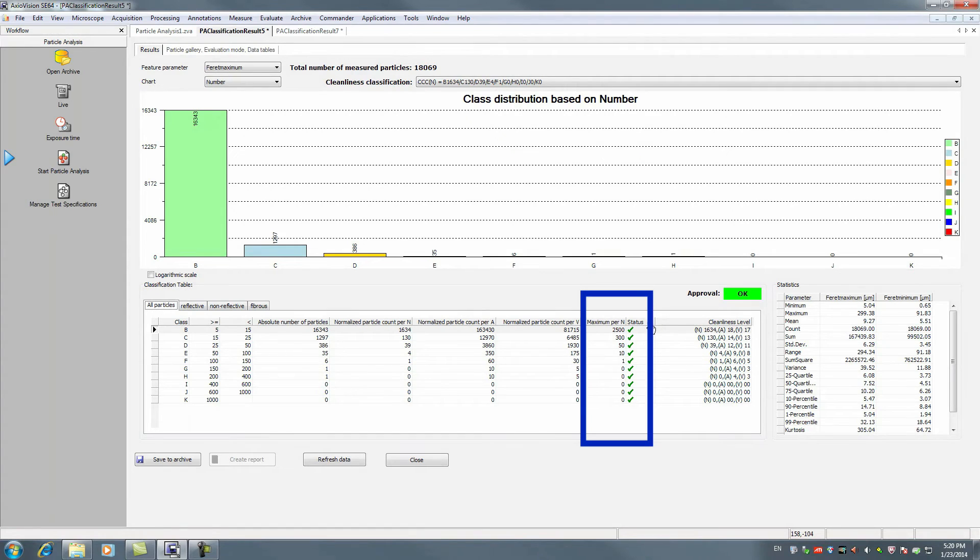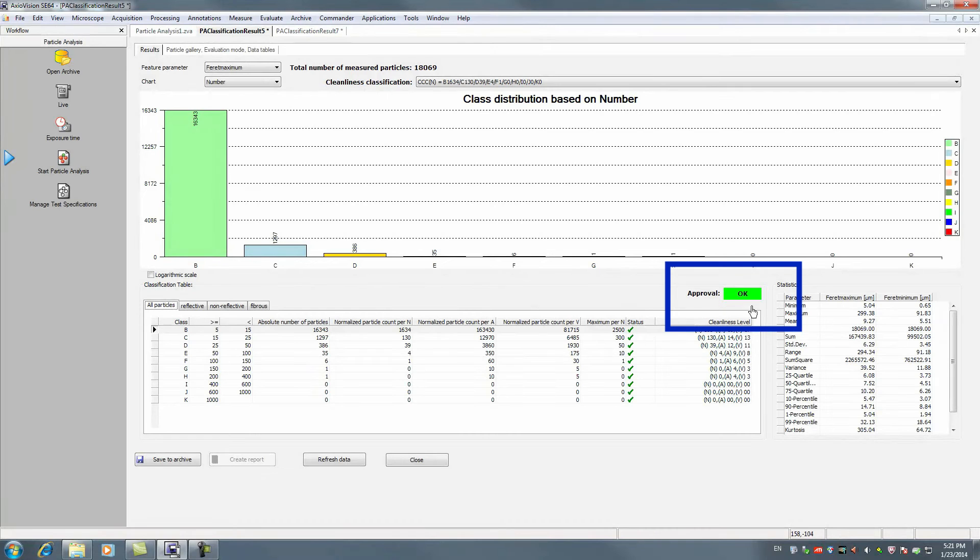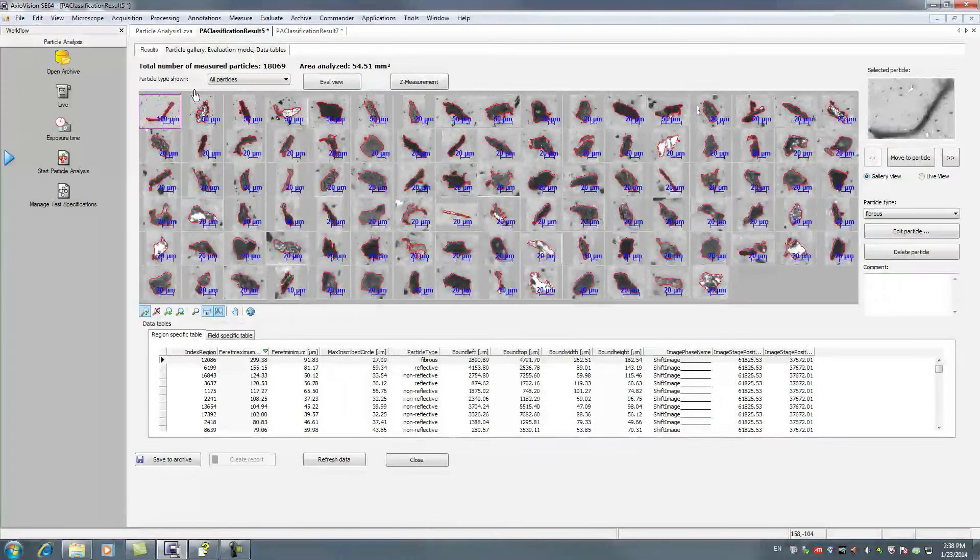Optionally, define a type approval for each particle size class. This gives an overall approval for all size classes.